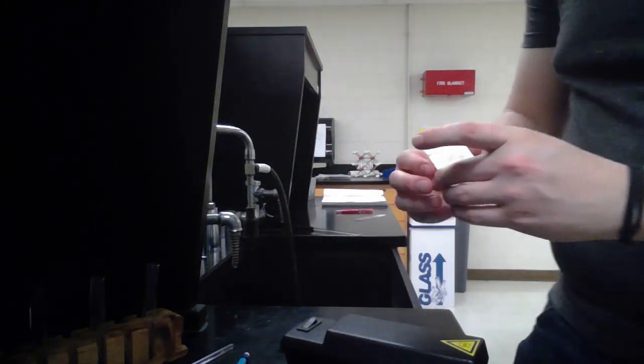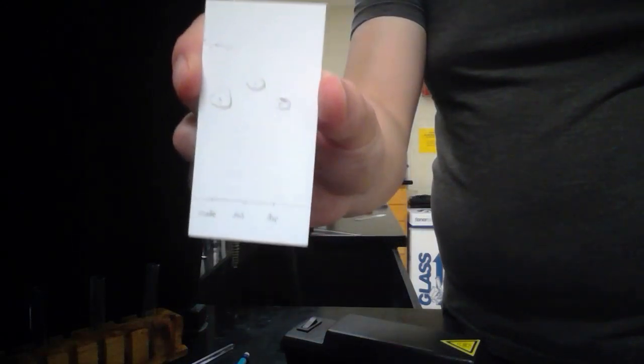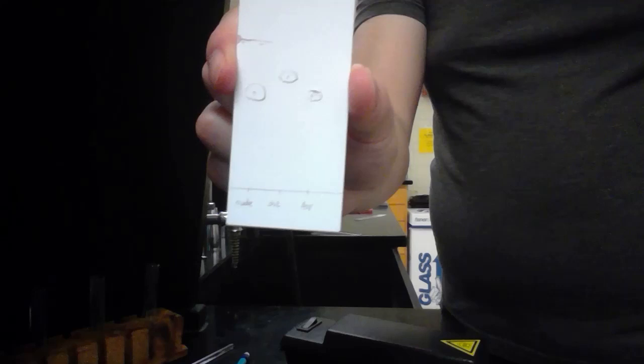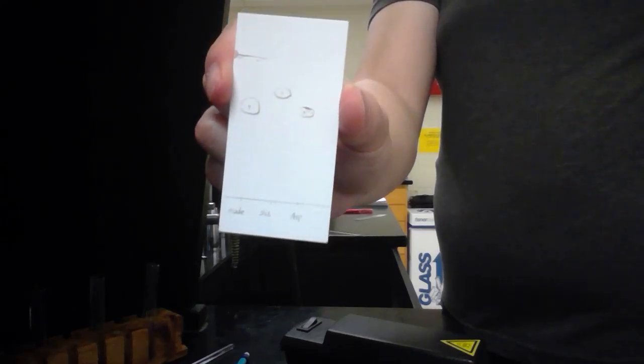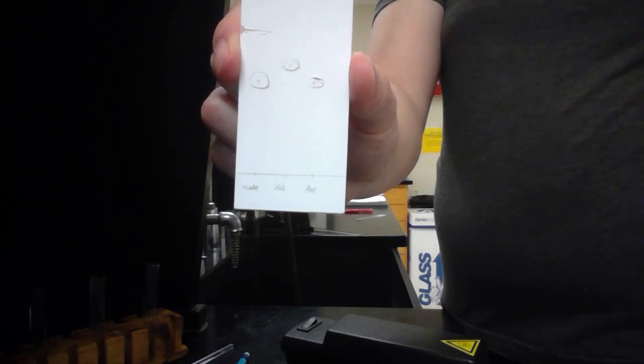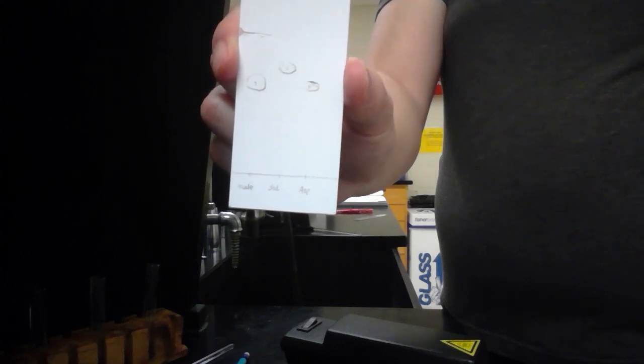Here we can see the results. The first one is our made aspirin, and you can see it lines up very well with the third one, which is the standard aspirin. The salicylic acid in the middle has moved further up, so we can see that our made aspirin matches up well with the standard aspirin.